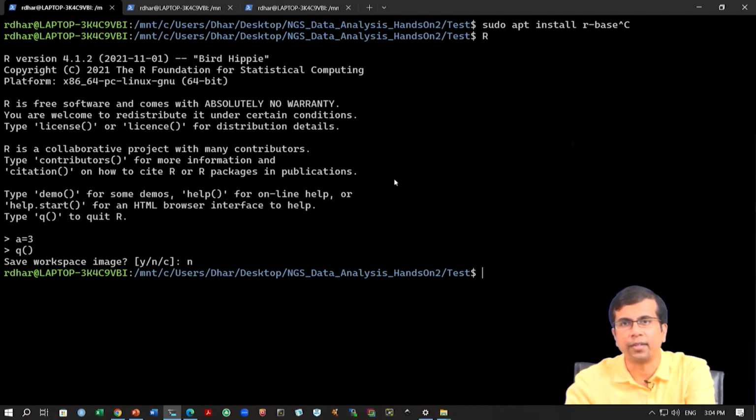Okay. So, it is that simple, but if you have a very long R code to run, let us say you have generated a very long code of R, then you probably do not want to run it this way, right. You have to copy and paste all those things. So, that is very cumbersome. So, you can run it as a script here. Okay. So, you can simply run, let us say, R and then -f and then the script name. Okay. So, this is also possible. We will not get there because we are not going to write very complicated scripts. I will show you small scripts one at a time, and we will run and execute those, and we will generate some of the results.